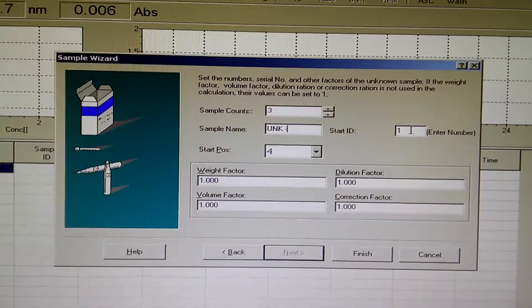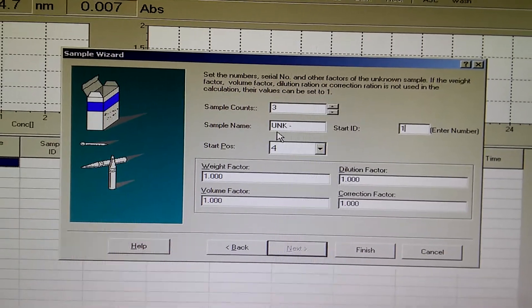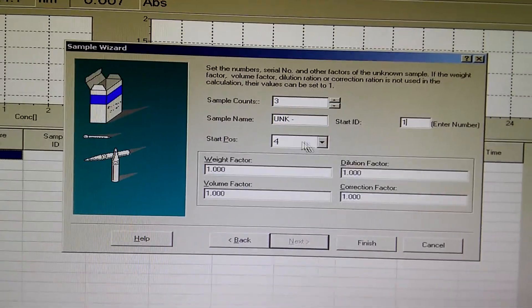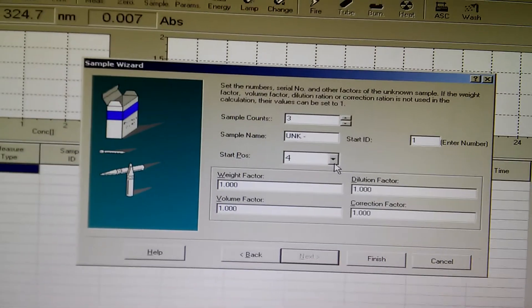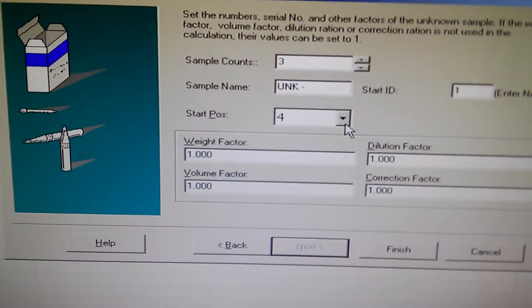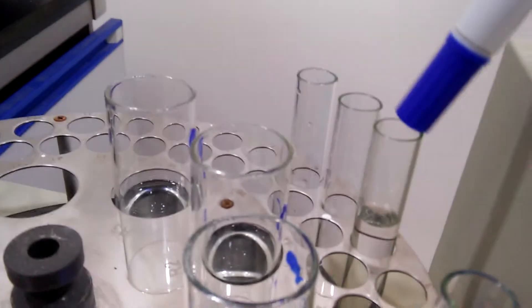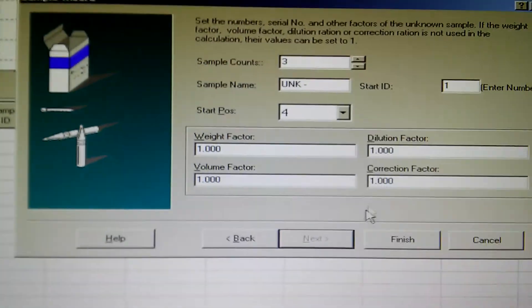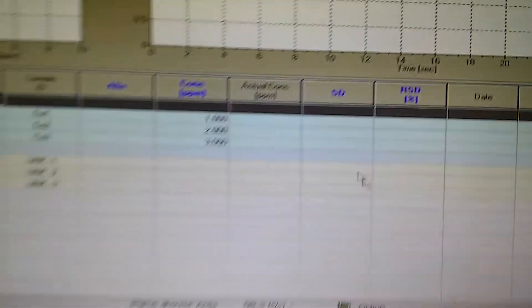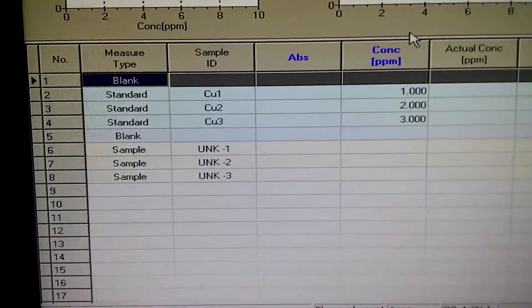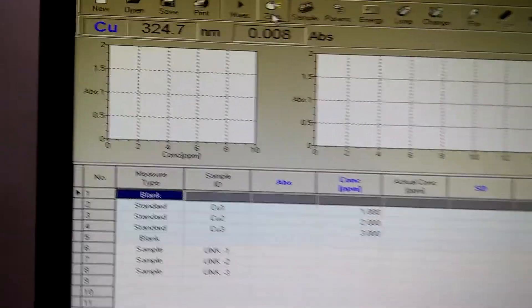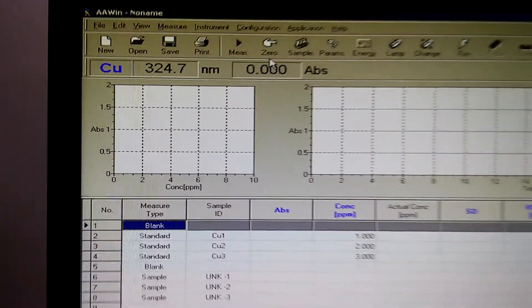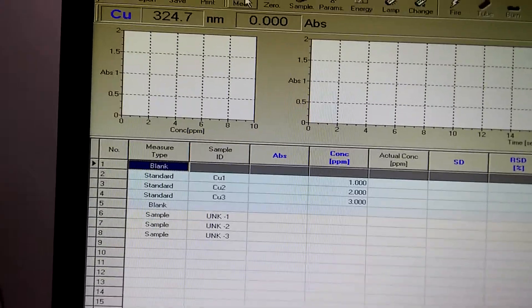I put the unknown in position four, so it will start for unknown from this point. All these factors have to be equal one. Finish. The instrument is ready. Now I will press auto zero, then press measure. Here we have to press start.